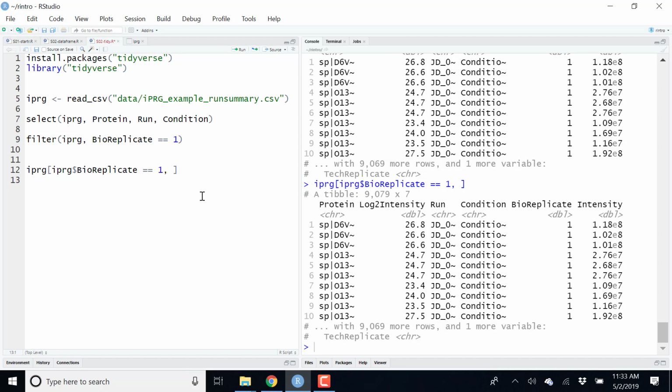But now I'm going to show you something else that will make this very attractive. What I'm going to show you now is a new cryptic character that we can automatically create by pressing Control-Shift-M.